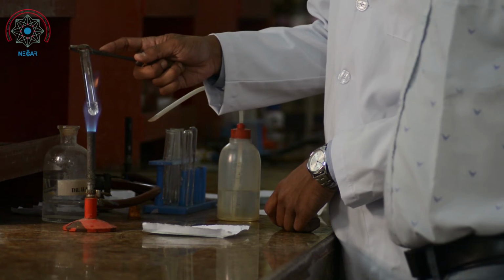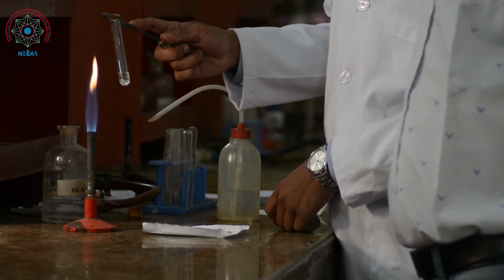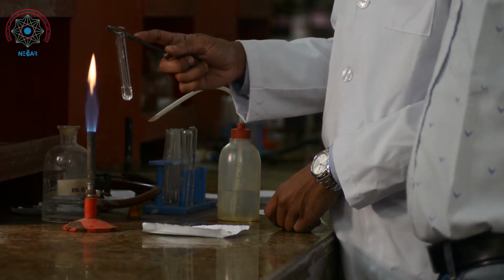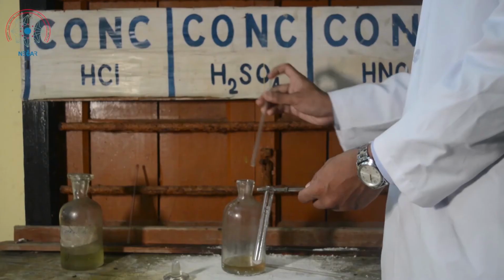In chemistry practicals, even if we don't observe any changes, that is also a result for us. That means with this we can tell that some of these anions are not present. In the second dry test, we will again dry the test tube and add the salt. Then we will add concentrated sulfuric acid.